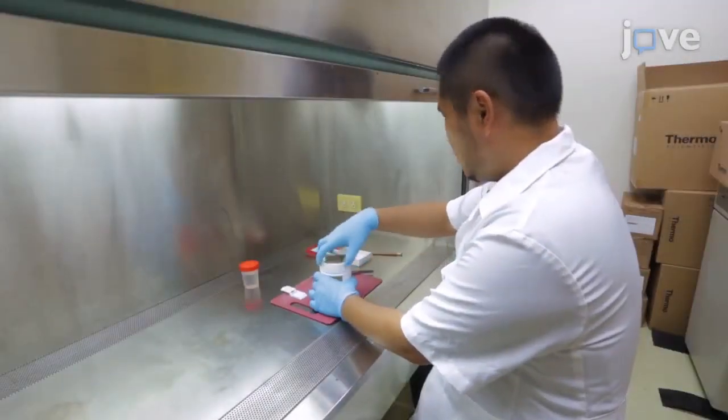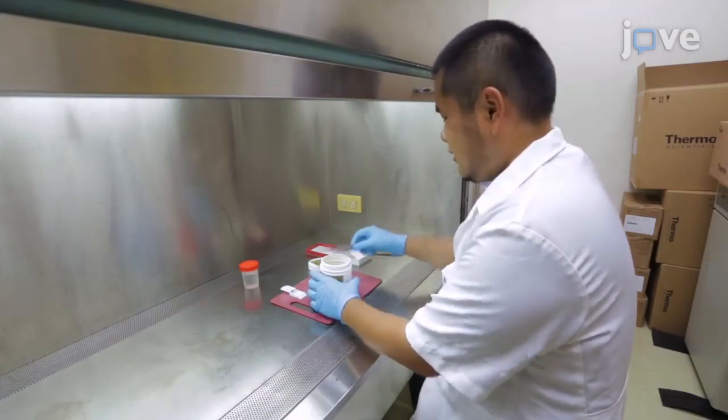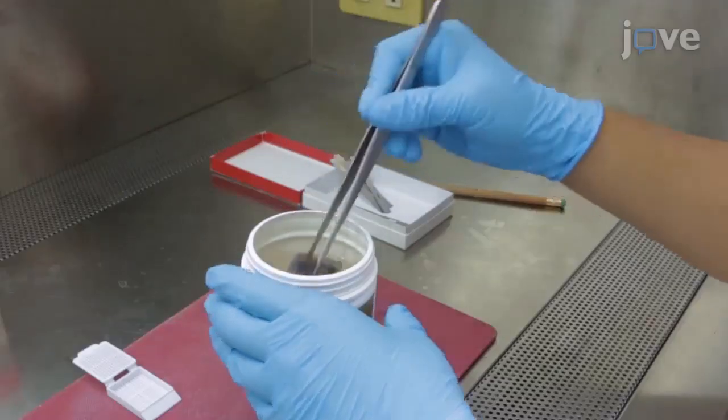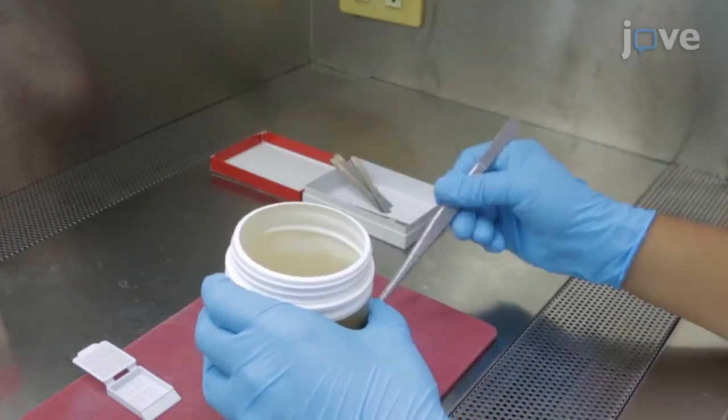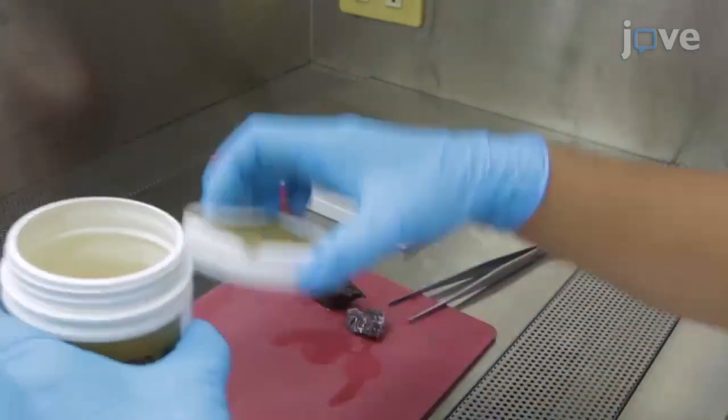Begin by collecting pair-matched liver and kidney tissues for AMG analysis from a stranded cetacean and fixing the tissue in 10 times the volume of 10% neutral buffered formalin for 24 to 48 hours.